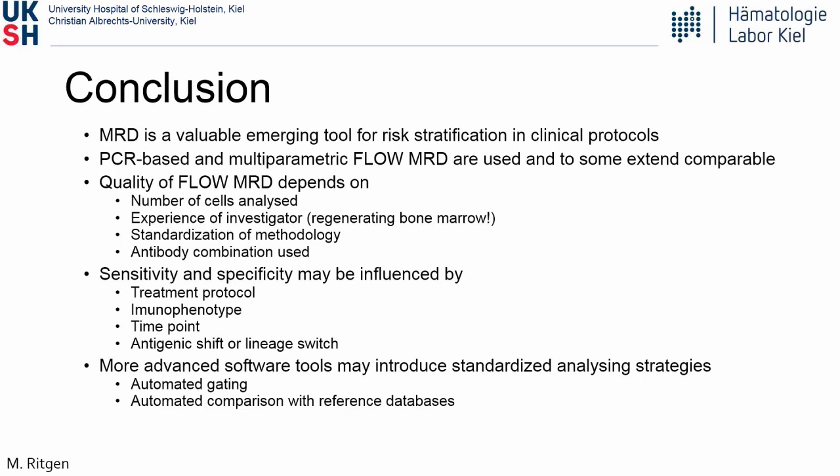Well, this is done with normal bone marrows in parallel, or even bone marrows which have been taken from treatment. So we normally do cross-lineage assessments. We try to use T-ALLs under treatment, and we analyze them by BCP-MRD panels to see how we would misclassify normal hematogones as B cell blasts. This is the best thing to do. The other thing you can do is merging electronic files together with regenerating files, but this is rather just an approximation. And the third method you can do is mixing diagnostic samples together with normal bone marrows in a dilution series to see how deep your sensitivity can go.